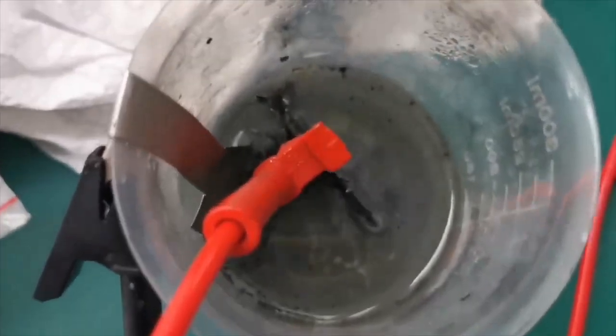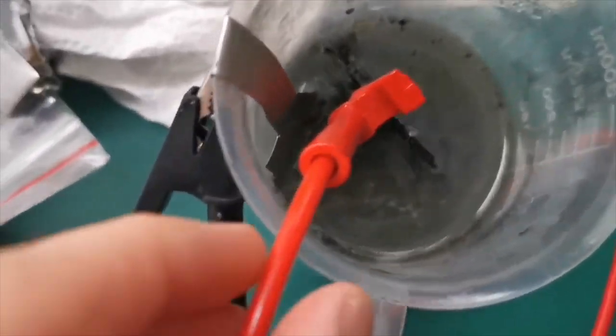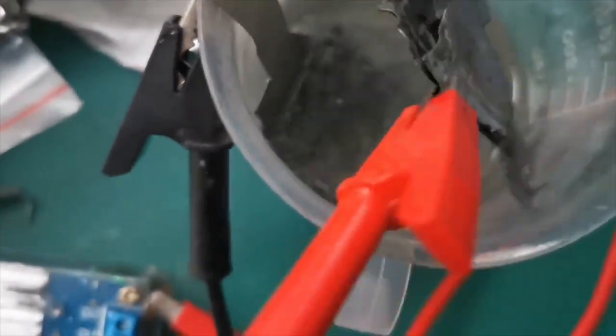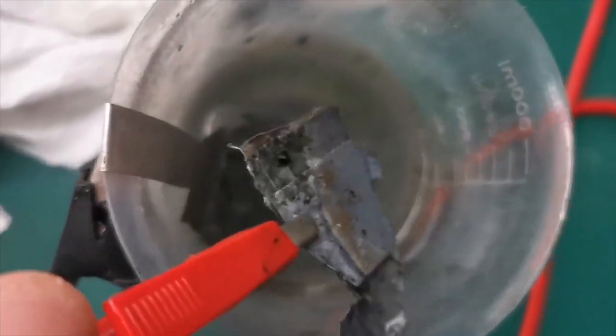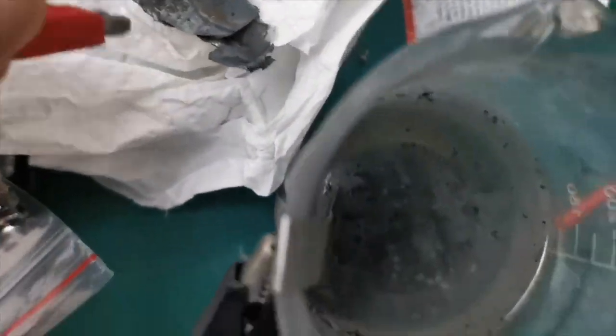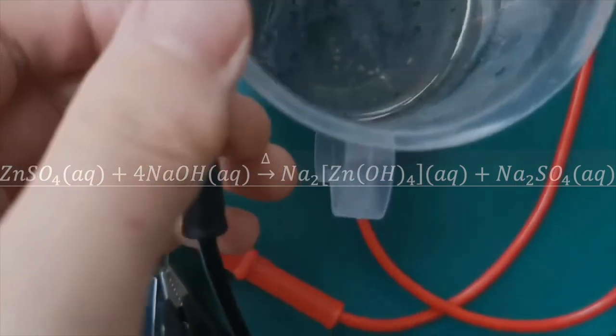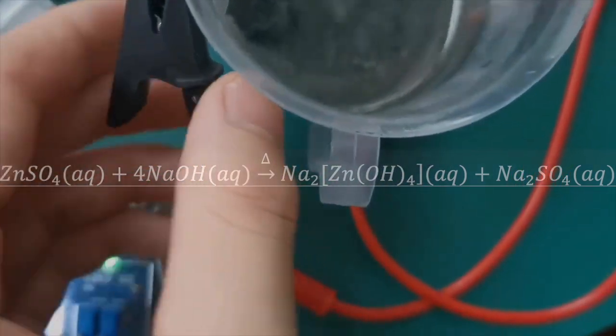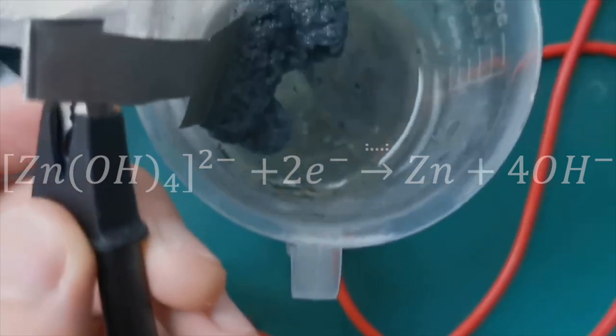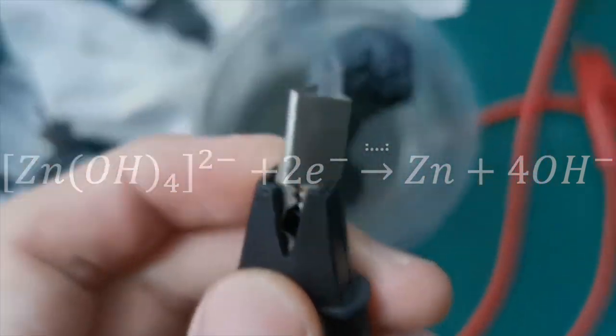All right, we are back around 30 minutes later and you can see that the zinc anode has decreased a lot in size, meaning that it has been corroded. On the anode, the zinc gives away electrons and dissolves into the solution as tetrahydroxyzincate ions. The ion can also be generated if you directly add zinc salts to an excess of sodium hydroxide. The ion then gets reduced on the cathode to form pure zinc metal.